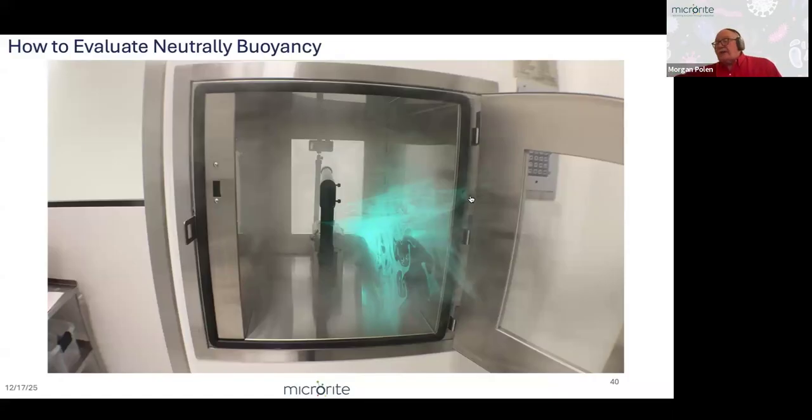And not necessarily because of the smoke, of course, because the smoke is generating millions of particles, but the mere fact that we have people in there who typically aren't media fill qualified conducting the smoke study. We have cameras, tripods, and oh, by the way, we're simulating our operations, which in the case of the filling operation, you're going to simulate setting up your filler, simulate broken glass, wiping up spills, doing corrective interventions. You're going to have to break the machine down and clean, sanitize, and sterilize where appropriate.